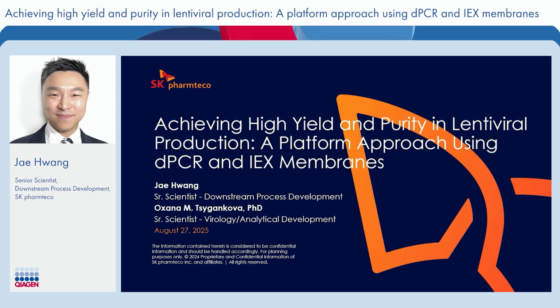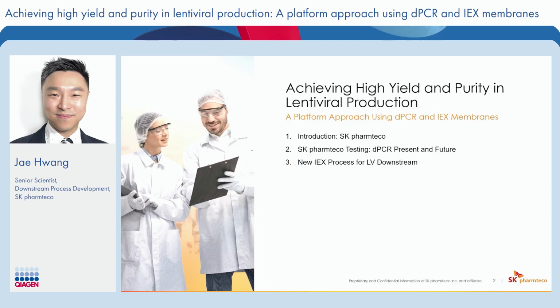So today, Oksana and I will present on achieving high yield and purity in lentiviral vector production, a platform approach using dPCR and anion exchange chromatography membranes. We'll start with a brief introduction of our company, SK pharmteco. Then Oksana will present on dPCR, and we'll end the presentation with our new IEX process for lentiviral vector production.